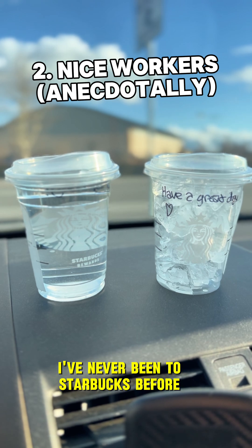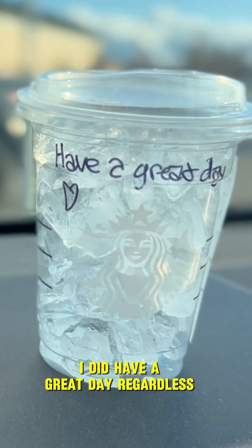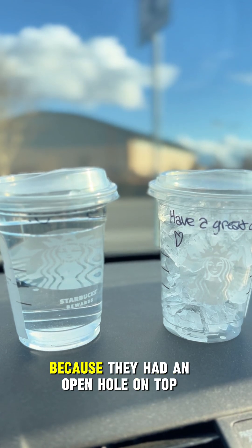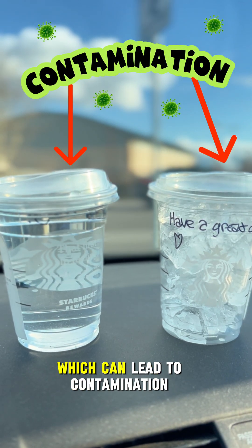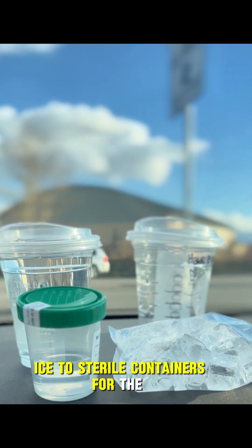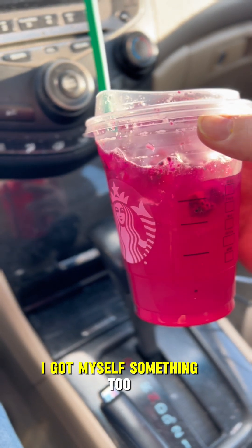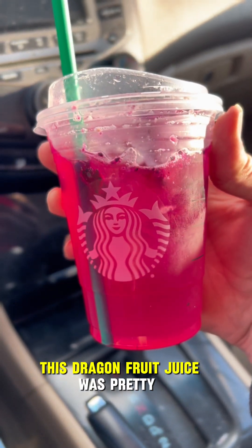I've never been to Starbucks before and I guess the workers there are really nice. I had an open hole on top, which can lead to contamination. I quickly transferred the water and ice to sterile containers for the trip to my lab. Also, because I've never been to Starbucks before, I got myself something too — this dragon fruit juice was pretty good.